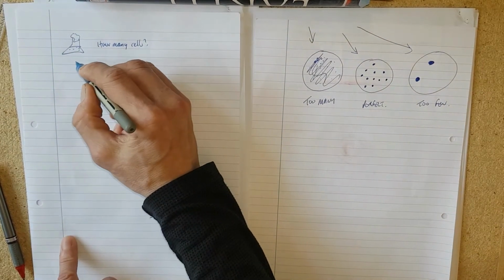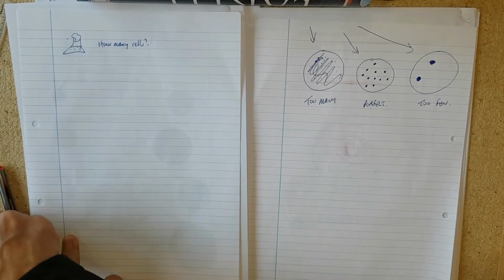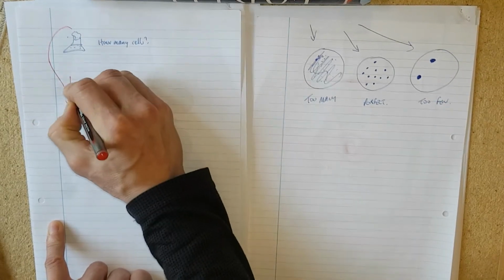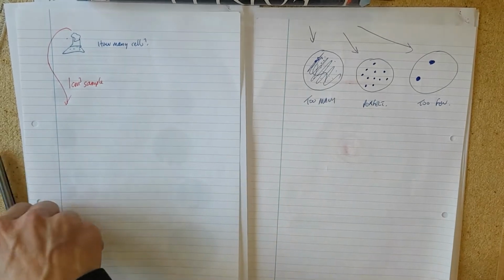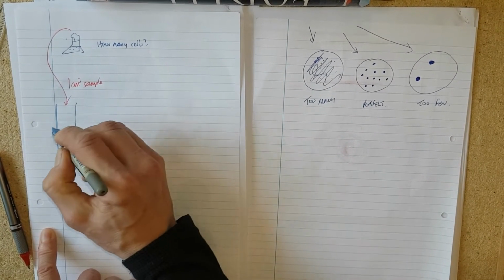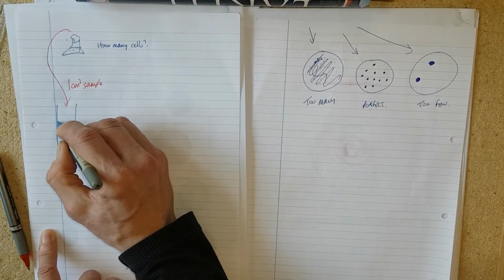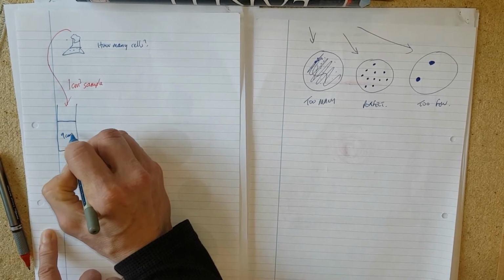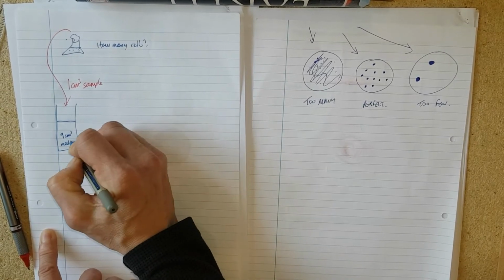So what we do is we take a sample out of here. We're going to remove, say, a 1 cm cubed sample, and we put that into a tube that contains 9 cm cubed of medium.